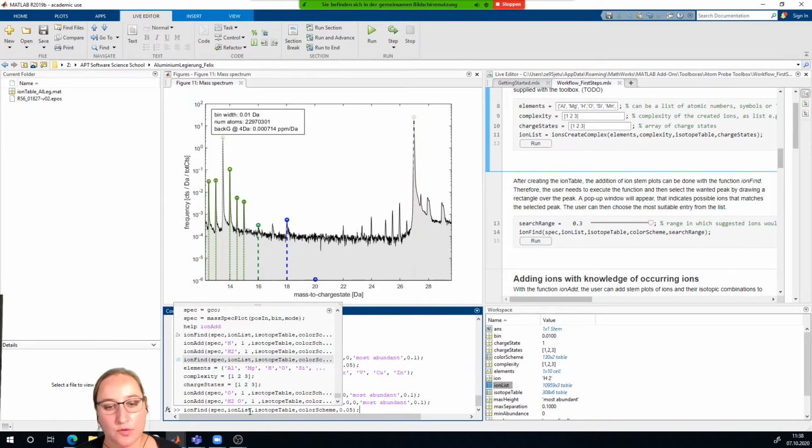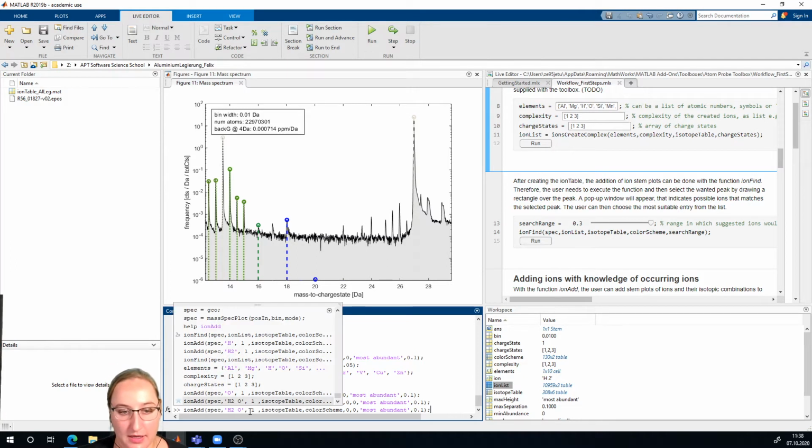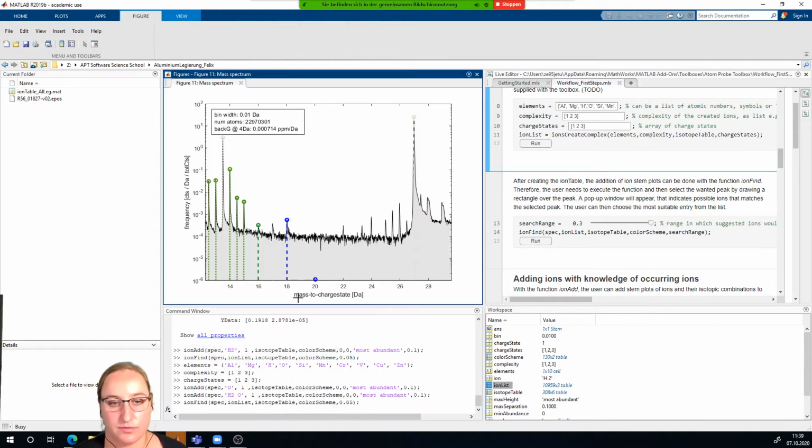All the time, if you write here a new one, maybe for the complete beginners with MATLAB, you can go with the arrow key ahead and you see the history, what you've already made for comments or for codes, and then you can, with the arrow keys, select one that you redo again, for example.